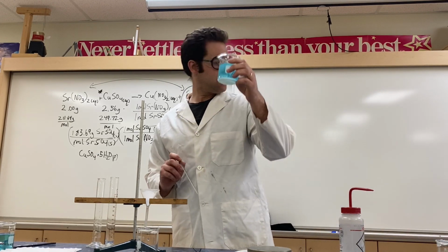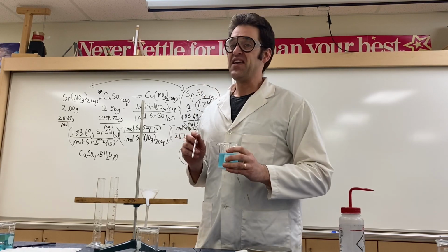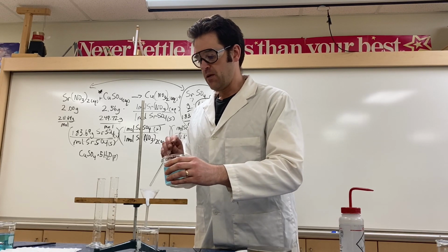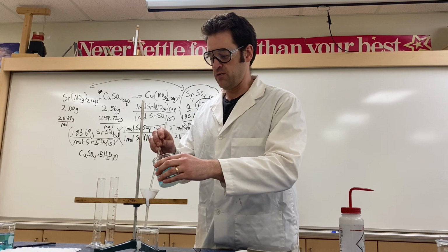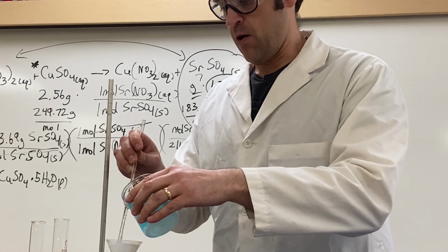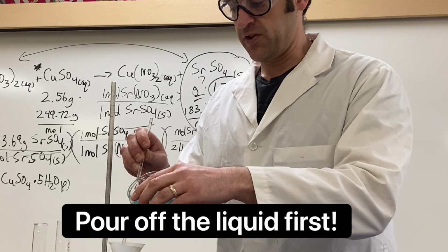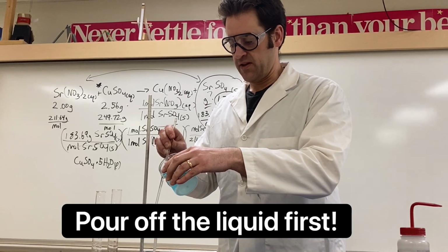Look at this. That's the one he got ready. This is the one that he let sit. So he's good. So I'm gonna do something called decanting, which I'm gonna try my best. I'm not very good at this, but what it does is it allows you to get the liquid into the funnel without clogging up the filter paper. So I'm just gonna try and get most of the liquid through by doing this technique.